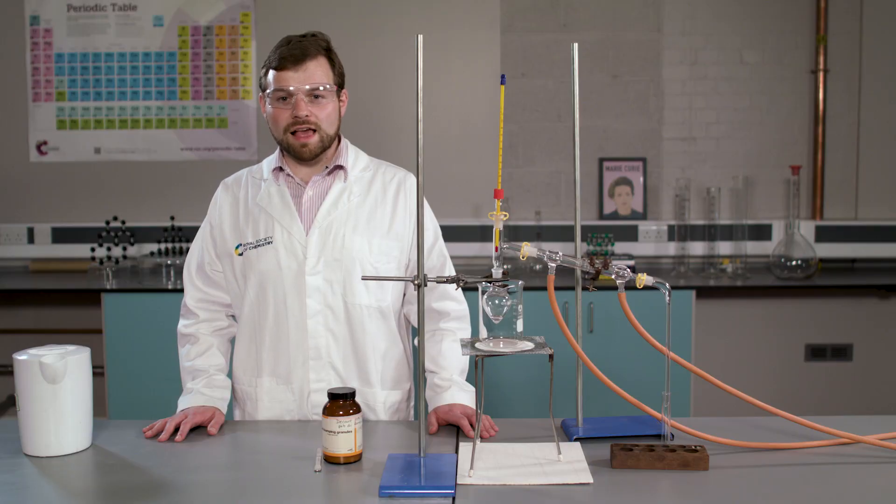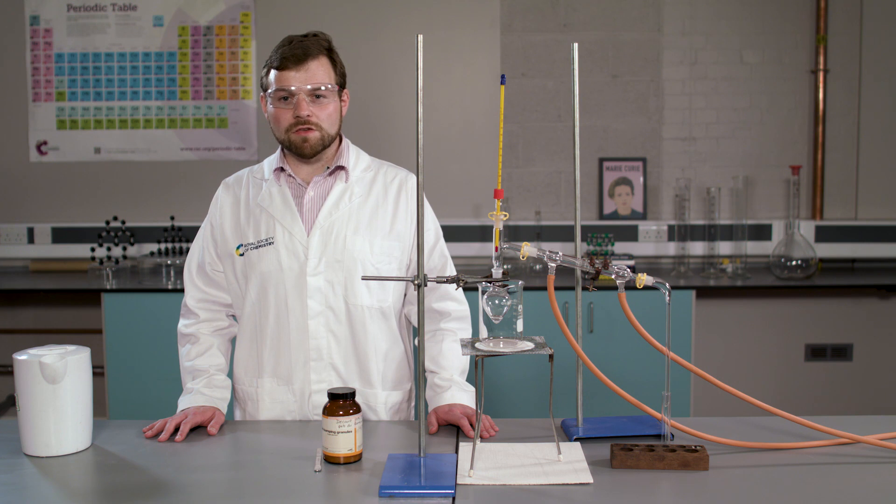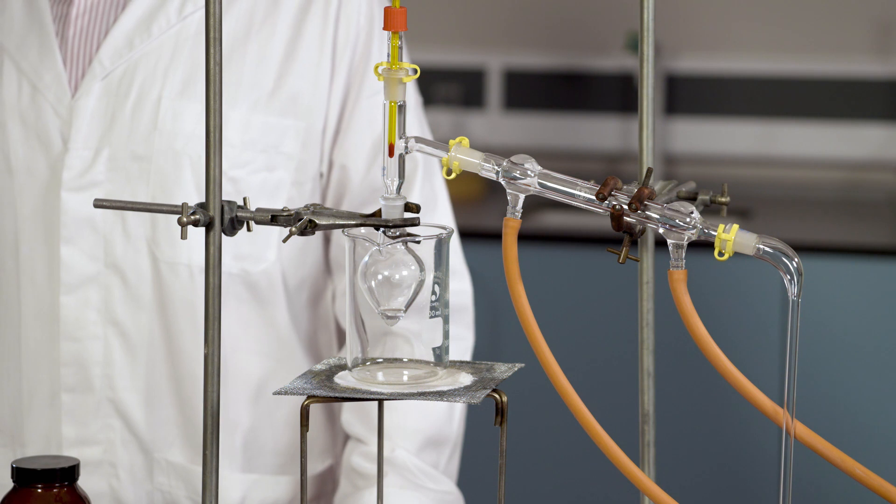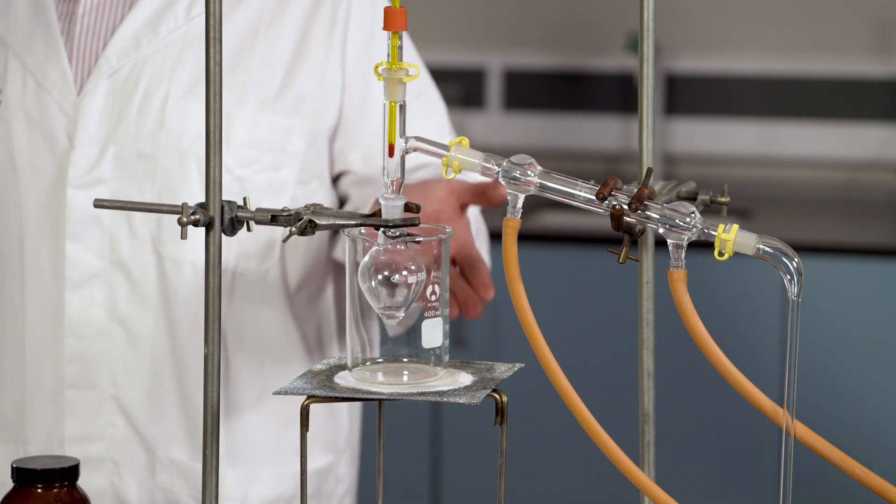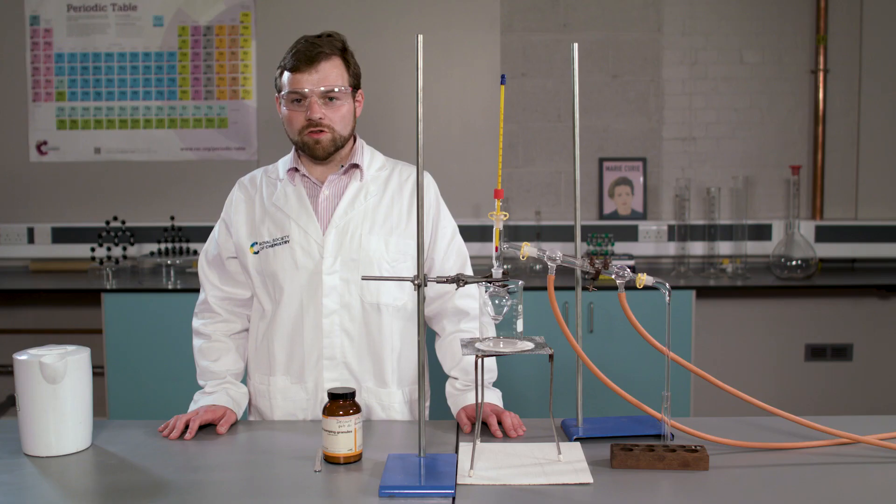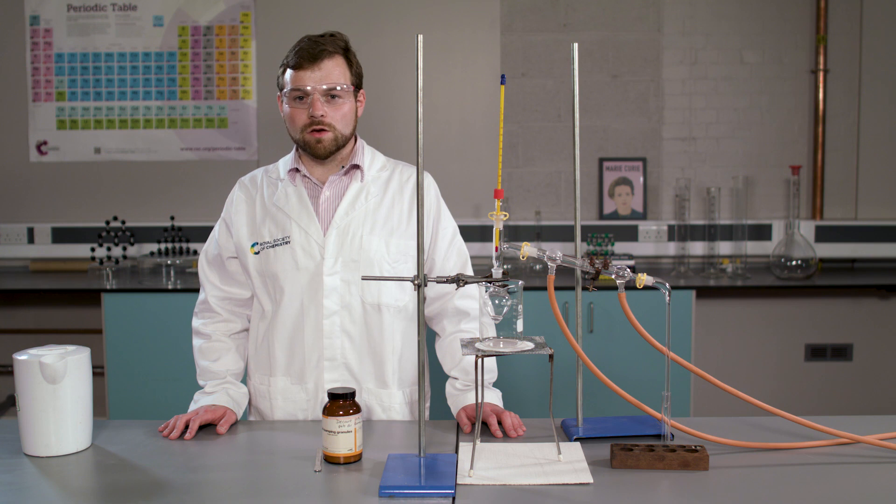Now we have removed the excess acid and water from our organic product. However, there may still be some unreacted reactant or organic by-product that remains. Therefore, we are going to purify our organic product further using distillation. Here I have our organic product from our filtration step and I have added some antibumping granules to the flask. The product we are making in this reaction is 2-chloro-2-methylpropane, which has a boiling point of 51 degrees Celsius.